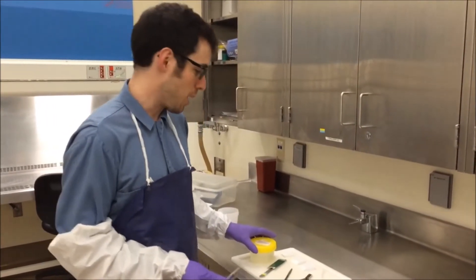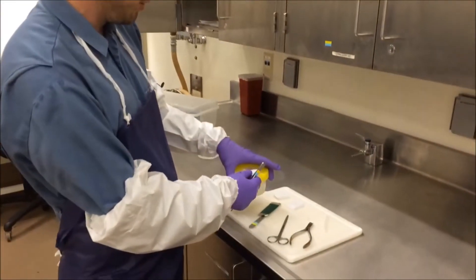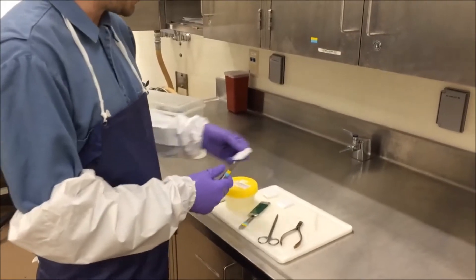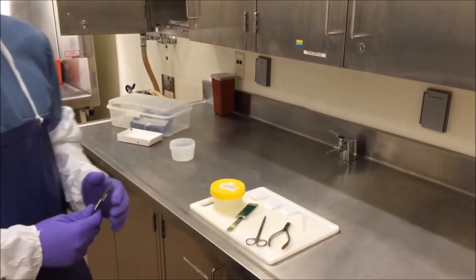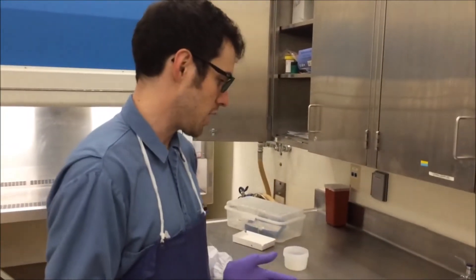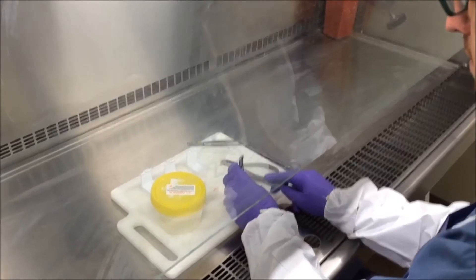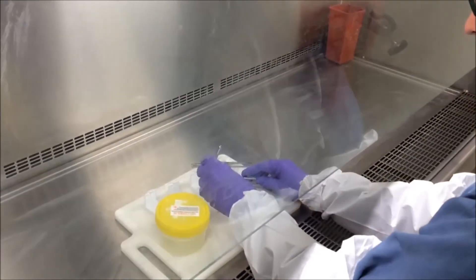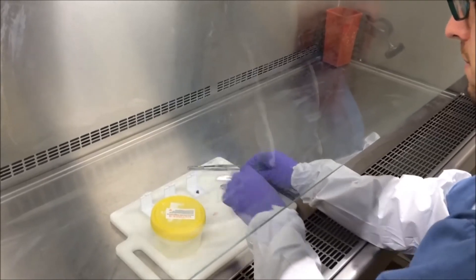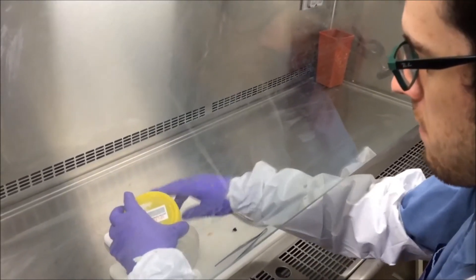All the tissues that we collect during necropsy we place them into small cassettes which we then place into formalin, a fixative that we need to have these tissues fixed in before we trim them in for microscopic examination. Dr. Scott is now looking at the tissue and he's going to take a small piece off and place it in the white cassette, and then that white cassette is going to go into the fixative where it will be processed and then made into a slide.